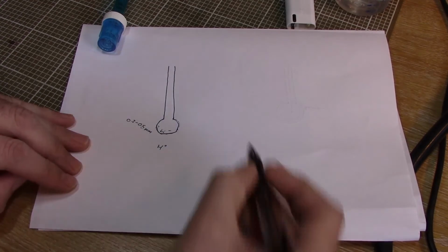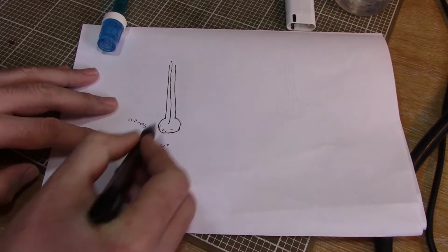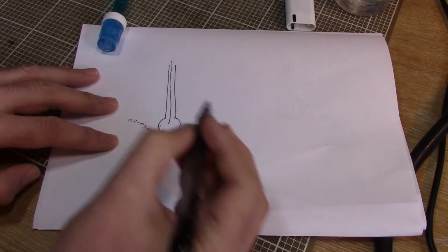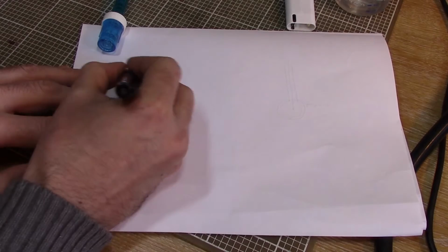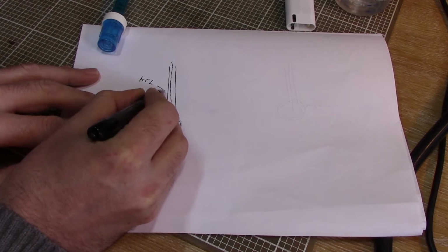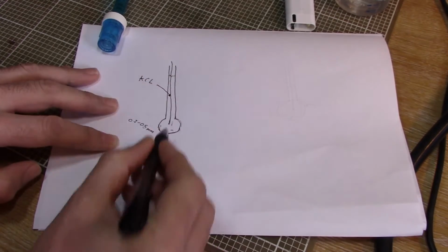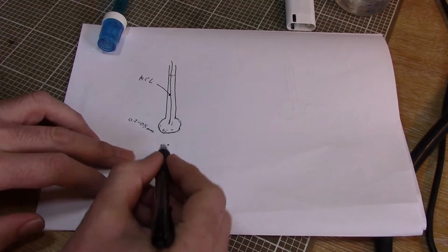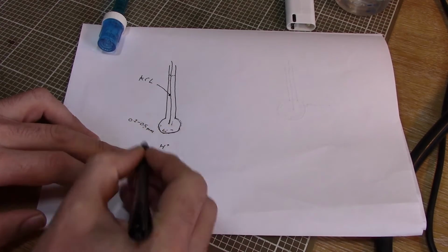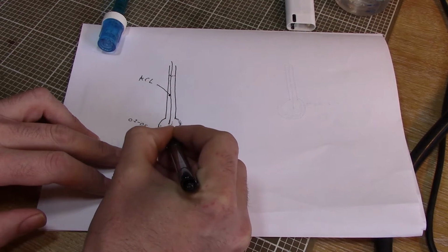Now inside the probe they put a silver wire, and the silver wire goes down, and inside this probe they fill this bit up with basically a buffer solution, something like potassium chloride, so it's KCl. And this wire down the middle is silver so that it doesn't react with anything. So we've got KCl liquid inside this electrode, and we've got positively charged hydrogen ions attracted there. Now at the same time that's happening on the outside of the glass, we've got positively charged hydrogen ions attracting on the inside of the glass as well.